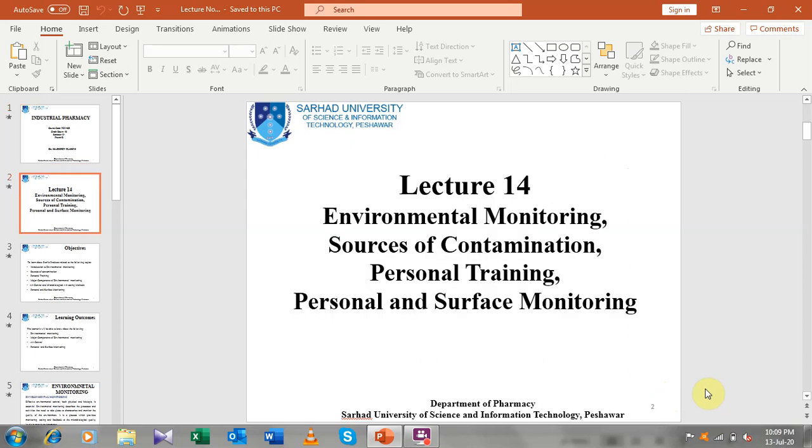Today is our 14th lecture, that is the second lecture of the 7th week. And in today's lecture, we will discuss environmental monitoring: how the environment of the pharmaceutical industry, specifically the sterile area, is monitored, what the different sources of contamination are, and personnel training. We will cover personnel and surface monitoring, and how personnel can be monitored, and how the surface and the areas can be monitored using different techniques. That is the title of the two-day lecture.